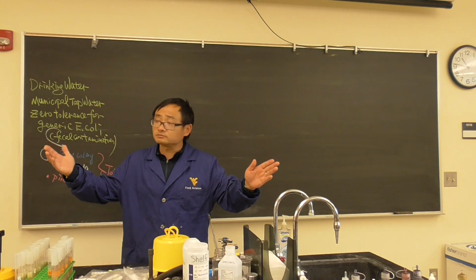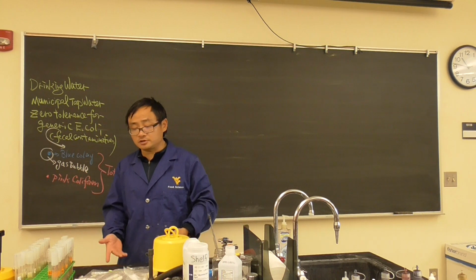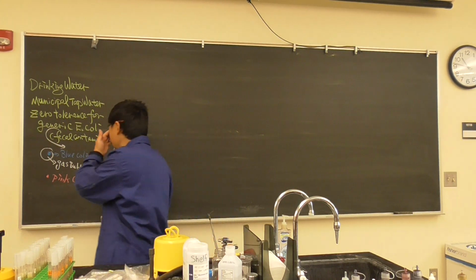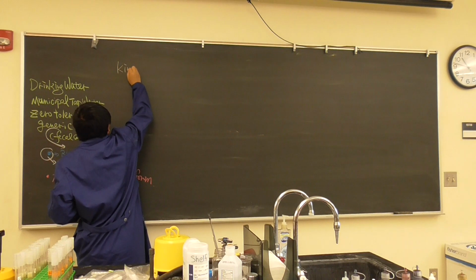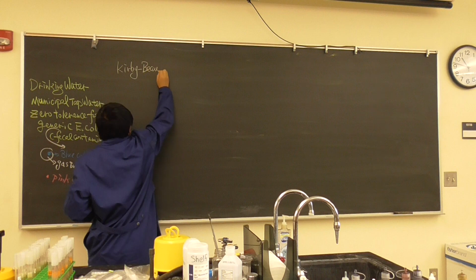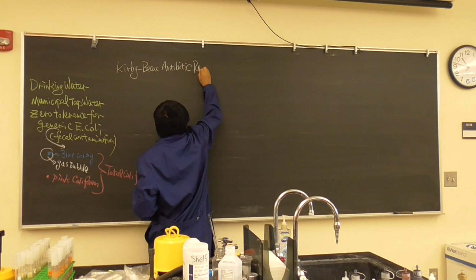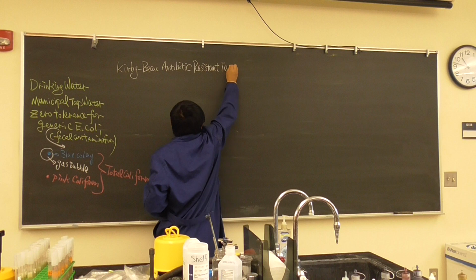Okay, today's work is simple. You may go home in 10 minutes, but we will do it because we talked about antibiotics, and we haven't done the antibiotic resistant test yet. So what we're going to do is the antibiotic resistant test.